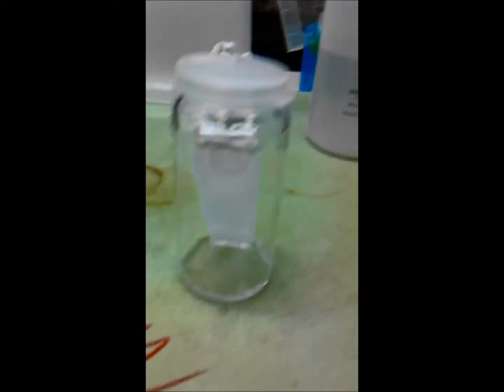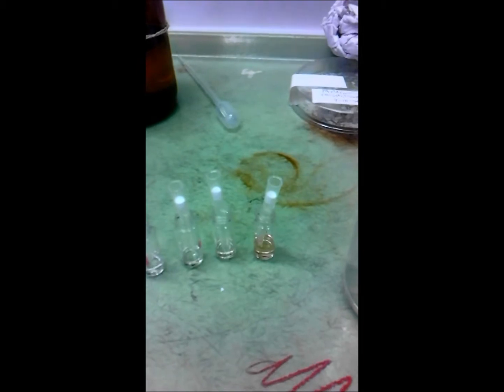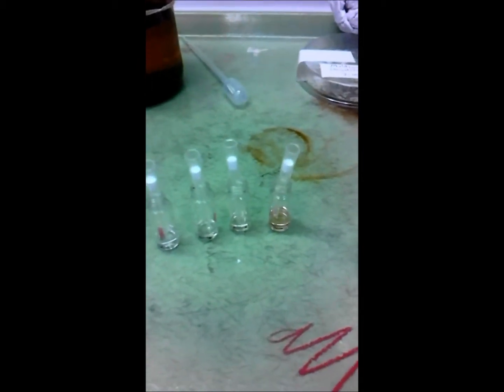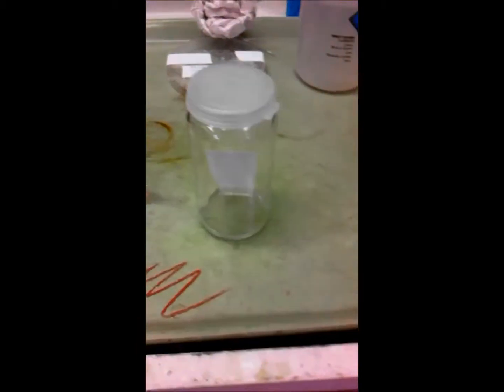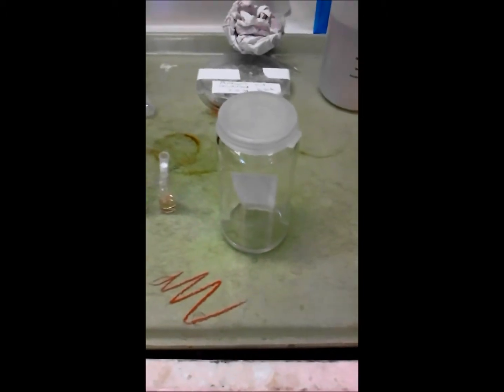I did a TLC plate, spotted 4 positions: the original Meldrum's acid in DCM, the Meldrum's acid with heptanoyl chloride with half of the equivalence of the acyl halide added, the final 1-to-1 equivalence of the Meldrum's acid and acyl halide at 0 degrees C, and then I let the solution return to room temperature and stir for 30 minutes, and it looks a little more reddish than purplish, but we'll see what effect that has. Running them on silica plates with DCM as the mobile phase.